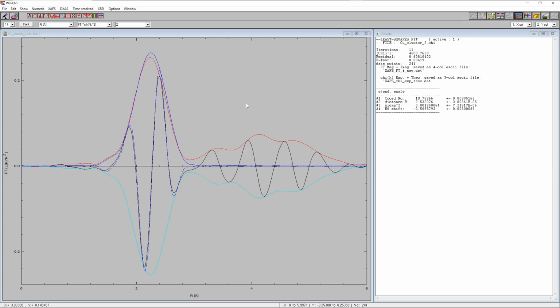Okay, so this is the EXAFS simulation and refinement using experimental phases and amplitudes. I don't want to prolong this tutorial much longer. Feel free, of course, now to experiment with those settings yourself, change the parameters, change the chi of k range, for instance, try to select a shorter range of the EXAFS chi of k, see how this affects the results.